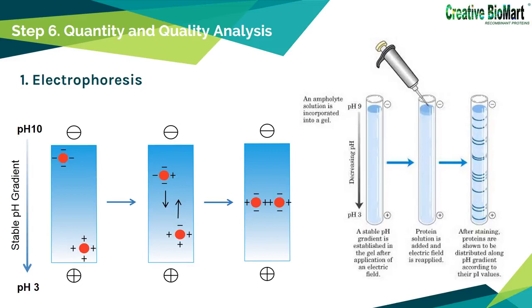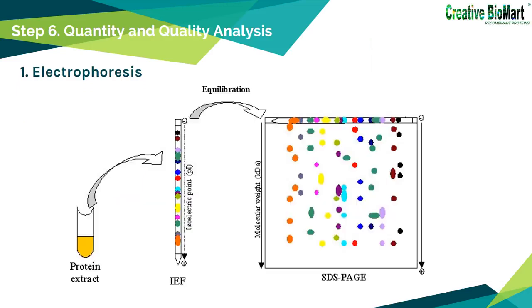Proteins can also be separated electrophoretically on the basis of their relative contents of acidic and basic residues. The isoelectric point of a protein is the pH at which its net charge is 0. Proteins with similar weight are less likely to have the same pI. Thus, using two-dimensional electrophoresis, proteins are separated in the horizontal direction on the basis of isoelectric point and in the vertical direction on the basis of mass.